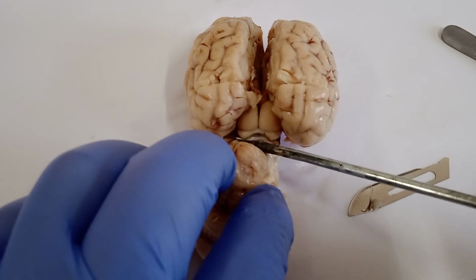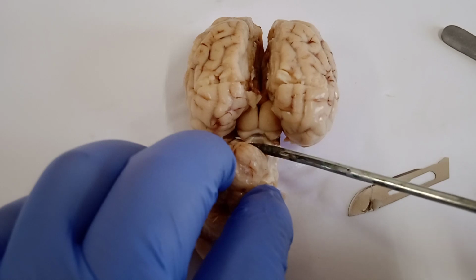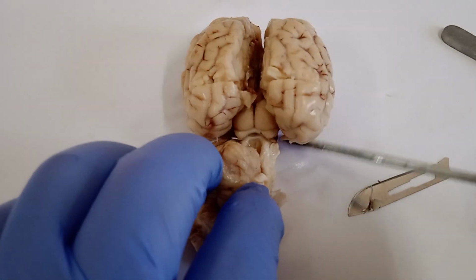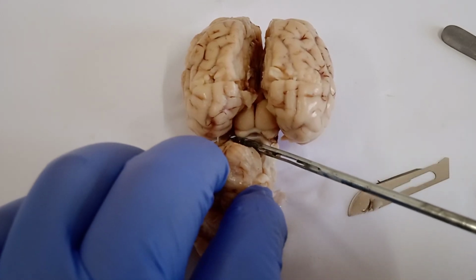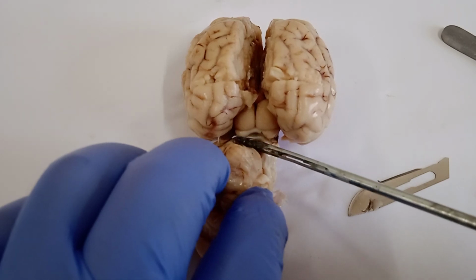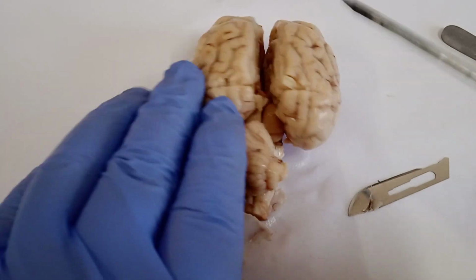So this is basically the fourth nerve. This is the only nerve that is coming dorsally. What I told in the last lecture, that all the nerves are coming on the ventral aspect. This is the only nerve, the fourth nerve, that is coming on the dorsal aspect of the brain. So you can see a nerve here. This is the fourth nerve that is coming on the dorsal aspect, because this is a dorsal surface.